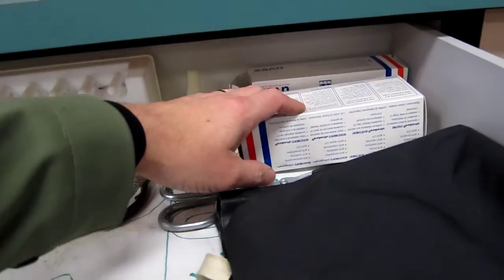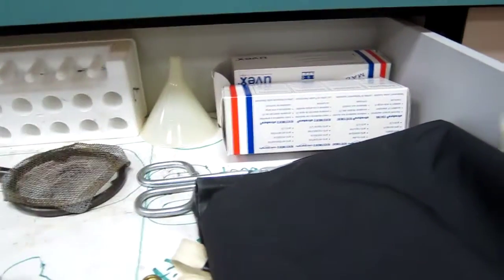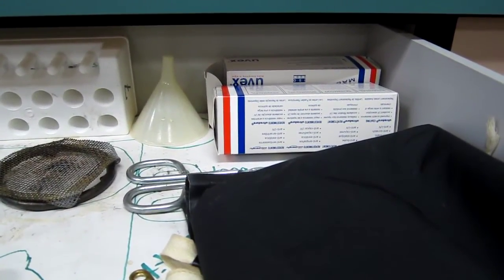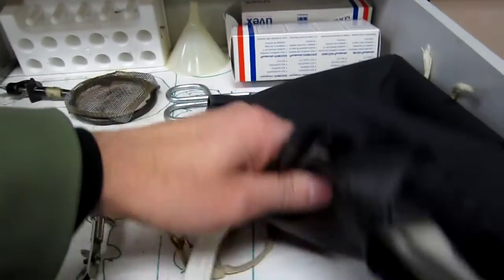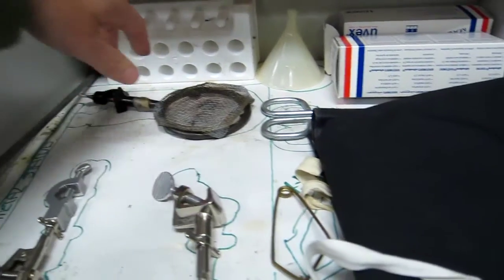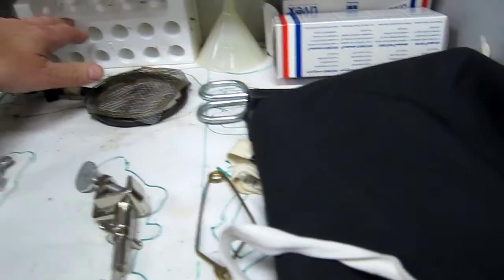Goggles, they come out of here in the boxes, but leave the boxes in the lab drawer, please. And when you're at your desk and you're doing a lab, you keep your goggles and your aprons on. And your test tube holder is right here. It's like a test tube rack.